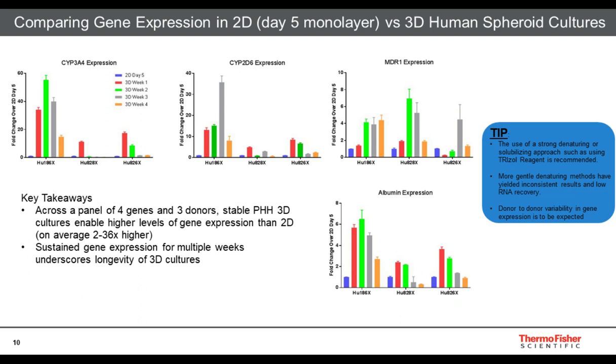So, again, this is consistent with what we would expect to see: enhanced expression of these key transporters that are at the basis of some of the fundamental physiological actions that are relevant for many folks working with these types of cells.